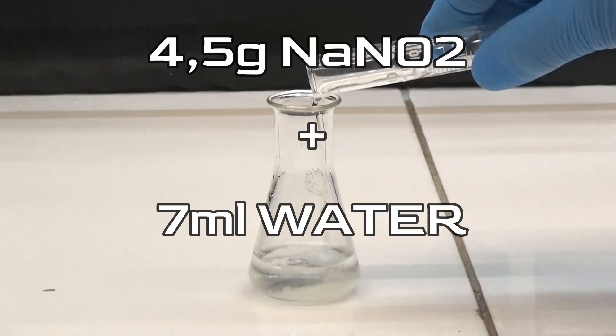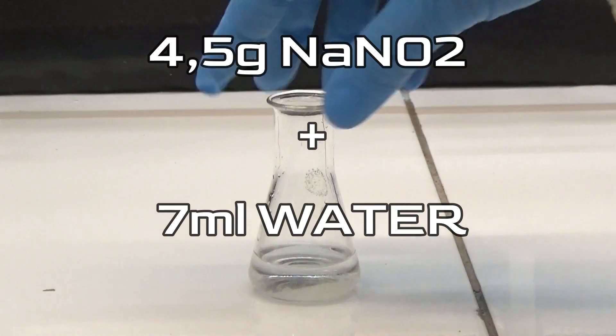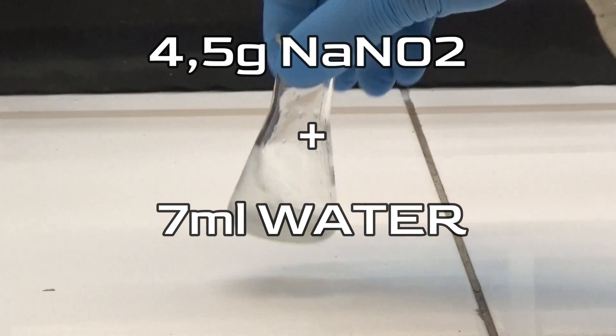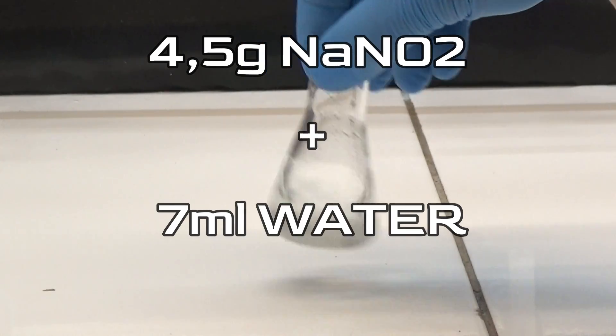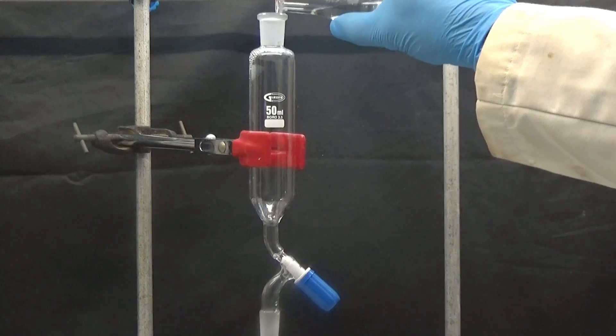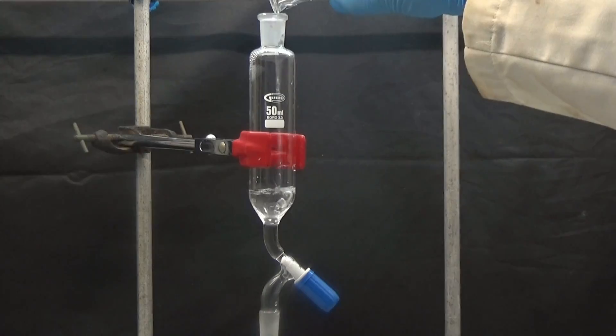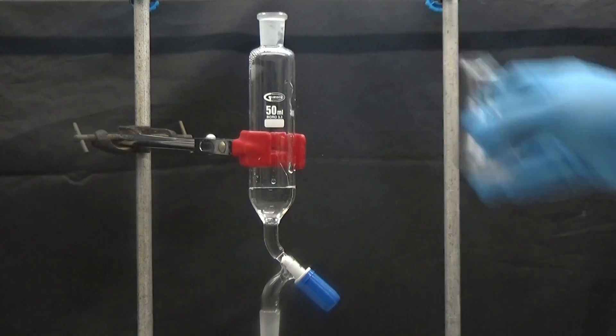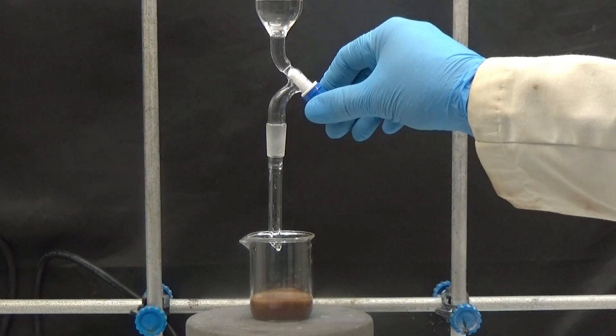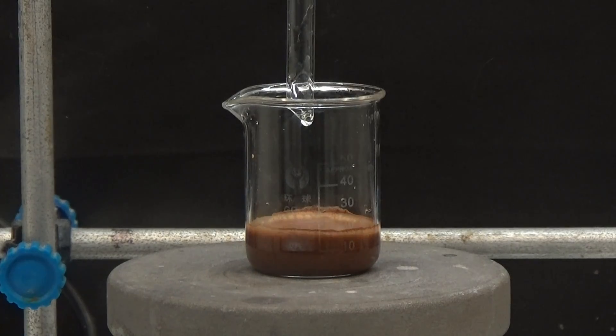Prepare a solution of sodium nitrite in 7 ml of water while the 1,3-indanedione is dissolved. After 30 minutes, pour the nitrite solution into an addition funnel that has a needle valve. We slowly add the nitrite solution to the indanedione solution.